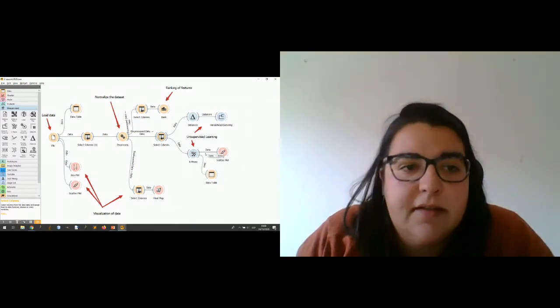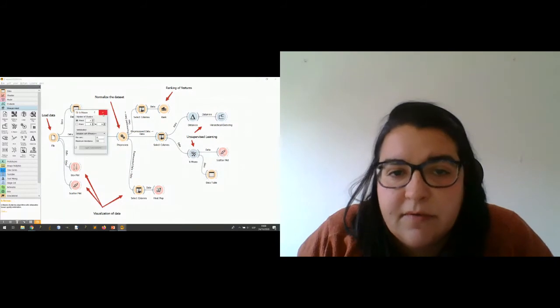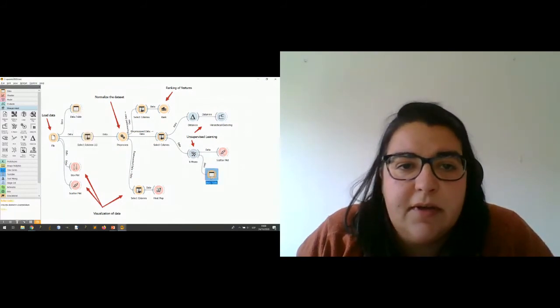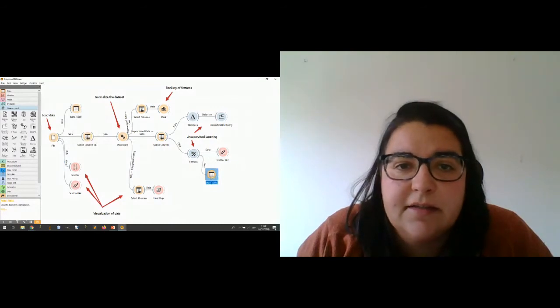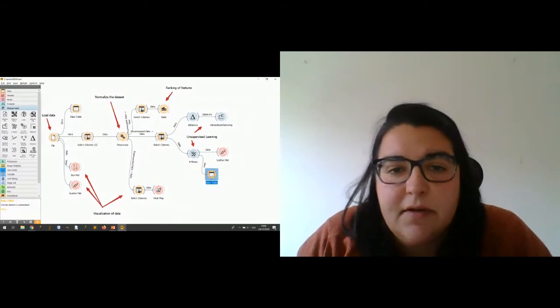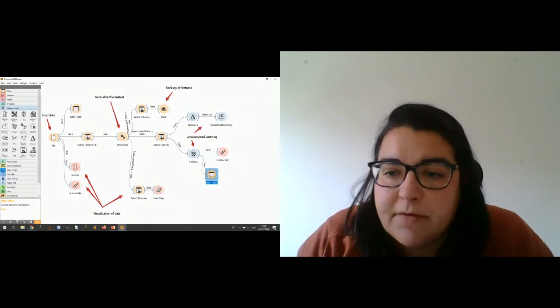So it's important to choose how many clusters we want. In this case, we want 4 clusters. And in the data table, now I have the information about our data here and the cluster. For example, this row belongs to C4, cluster 4, or cluster 1, and so on.